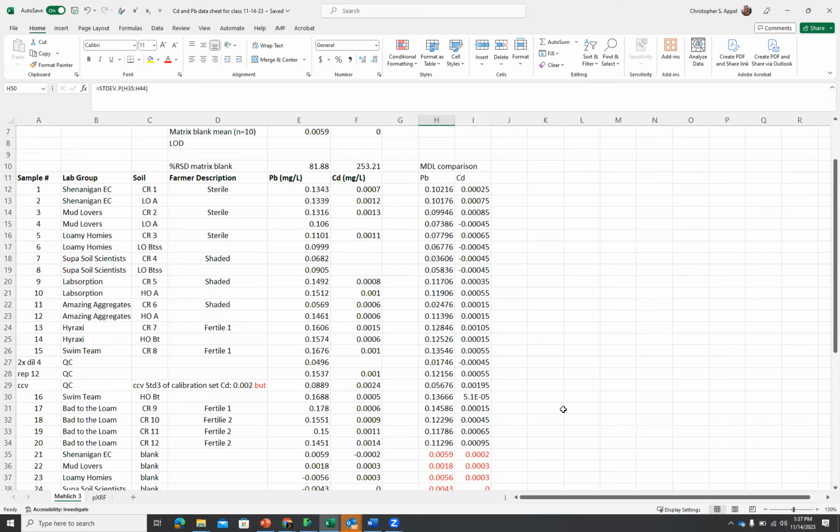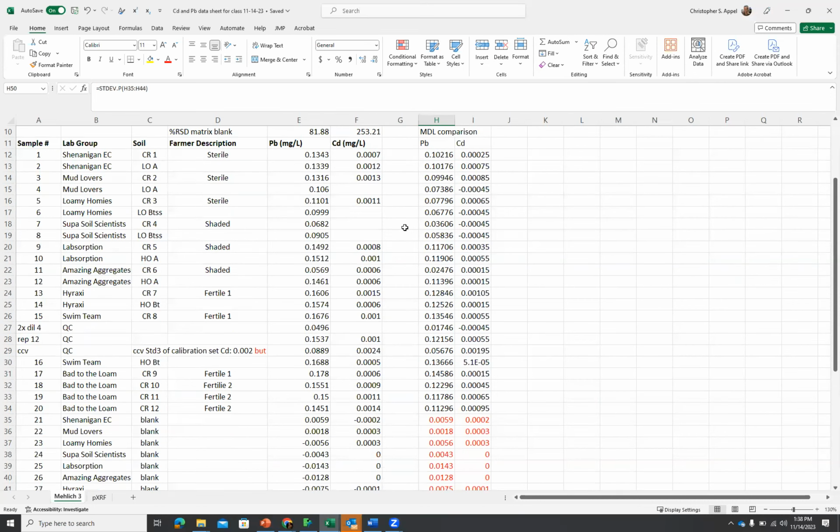Yes. Sorry, you deleted it in which row? The next row? The place that we're going to do all of our calculations is in the bolded columns. And so I just compared my MDL comparisons. So whenever I had a negative number over here, I deleted it over here. Okay. And so we only have that for cadmium, right? In those places where we have deleted values.